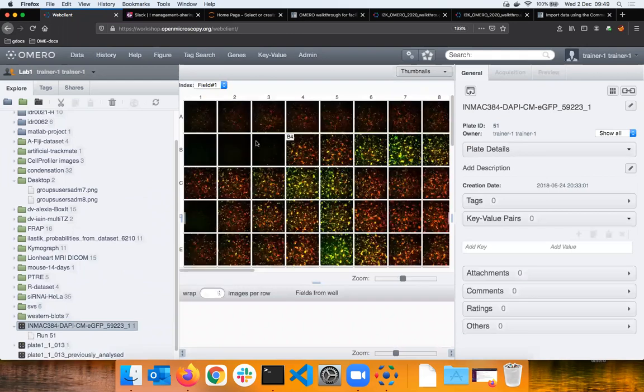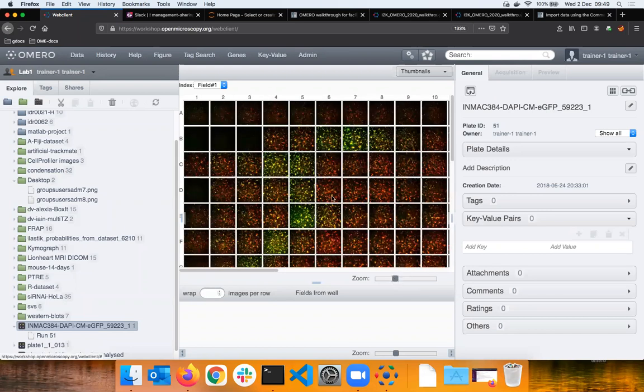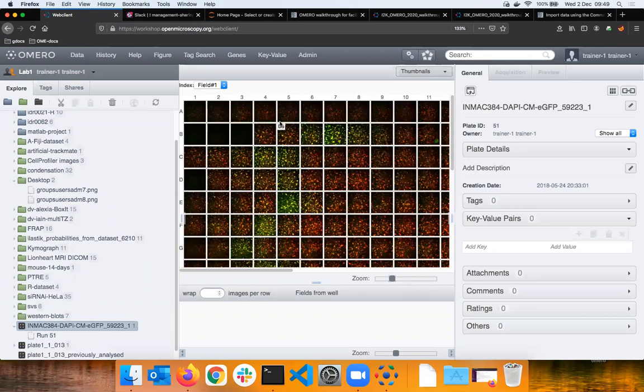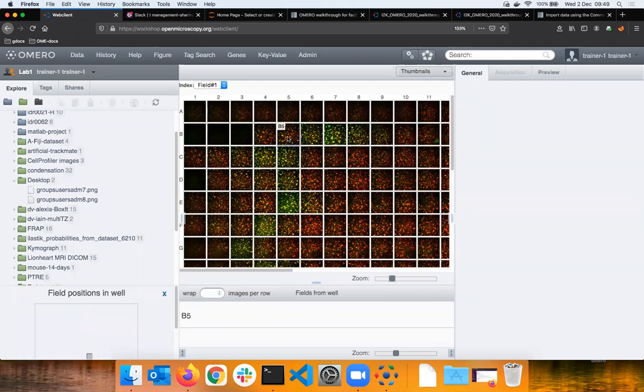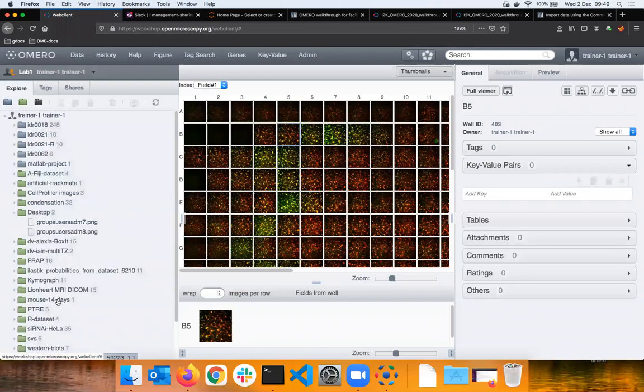So this is basically the 96 well plate, and you have an automatic microscope which will shoot an image in each well or more images in each well, and then it stores them in some formats like Flex or Operetta, and Bio-Formats is then able to import the whole beast with the superstructure containing the wells and images in them into OMERO, and that's how it looks like. Okay, so all these very different file formats are side by side here.